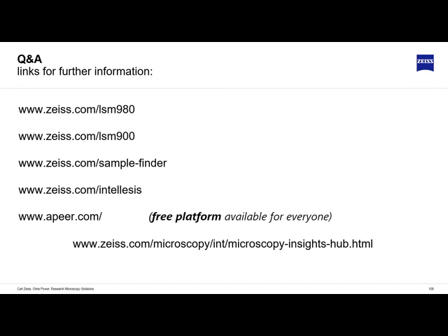And we just received one other question. Go on. Is FLIM possible with LSM 980? Yes. I mentioned that in the first part. We do FLIM either with VisFLIM or with NLO, and with a choice of electronics manufacturer and detector type, depending on what you're looking at. Okay. All right. So last chance for your questions.